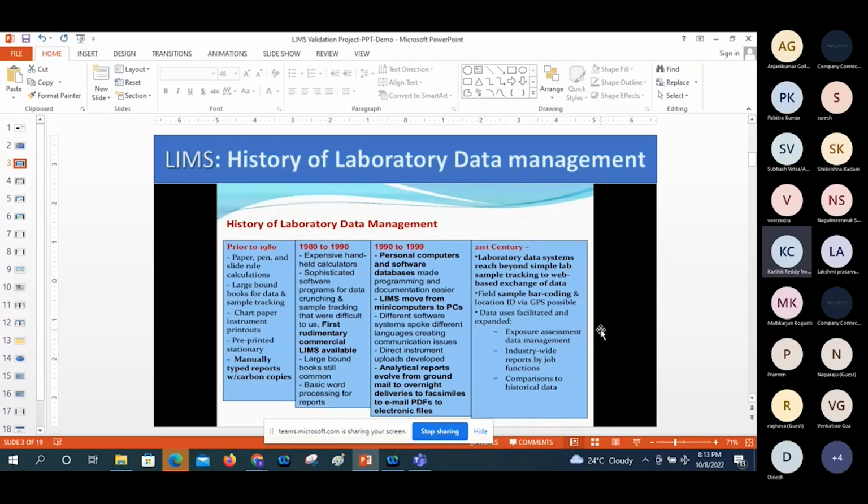So generally, there are huge numbers of modules available: lot management, sample management, inventory management, instrument management. There are 8 to 9 types of modules available in current LIMS applications. Whatever we follow on paper can be transferred to the LIMS application. So how can we implement this through validation? The V-model lifecycle approach can generally be followed in pharmaceutical organizations.